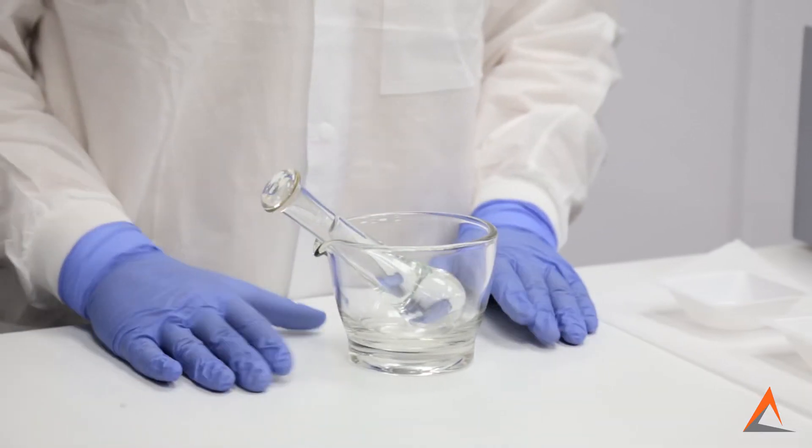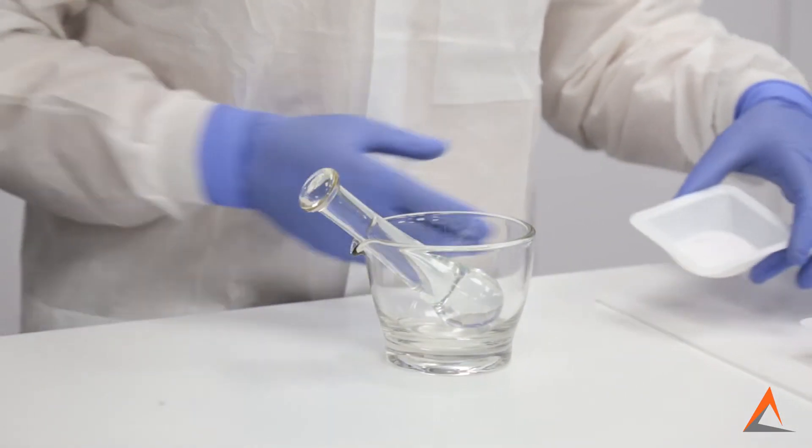The goal of triteration is to reduce the particle size of your powder ingredients. To correctly triterate your ingredients, you will need to apply sufficient force to effectively achieve the desired result.